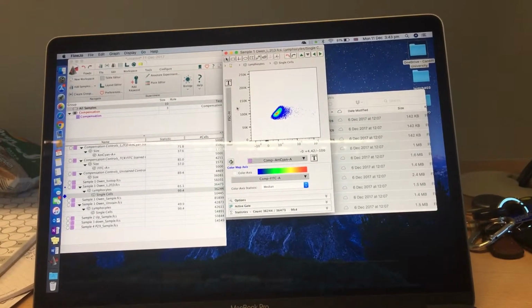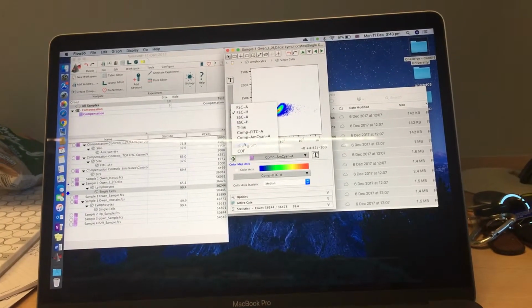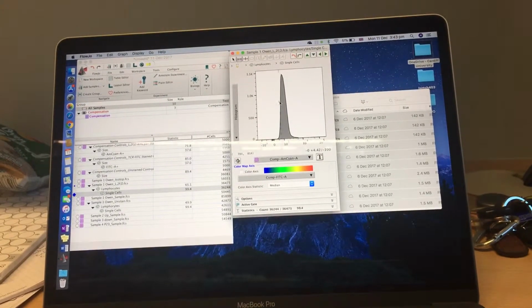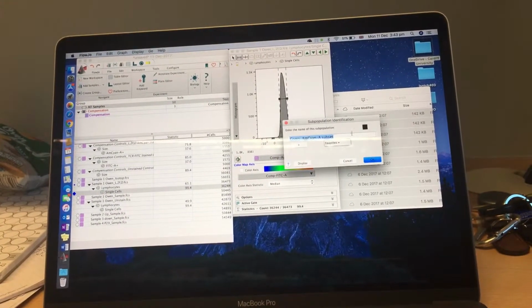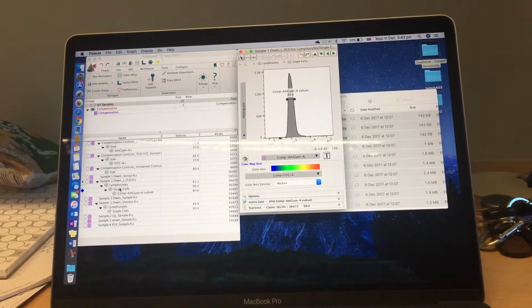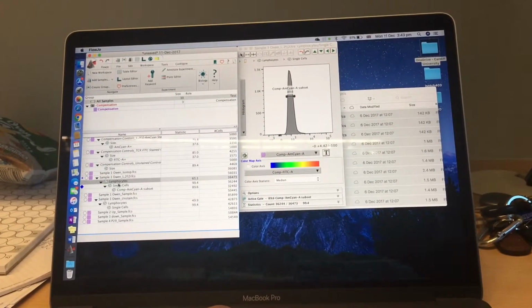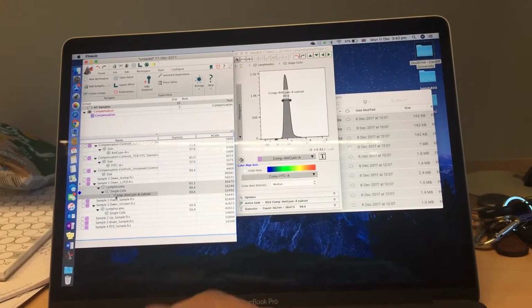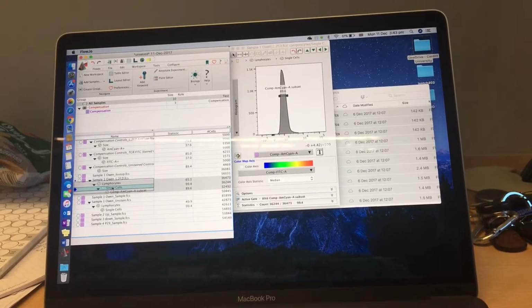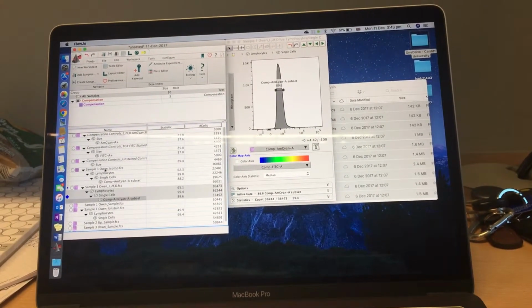Cyan. Histogram it? Histogram? And now drag those three from the Live Dead. So lymphocyte, single cell, cyan. And then drag that to isotype. Yeah, this is nice. And now open cyan.